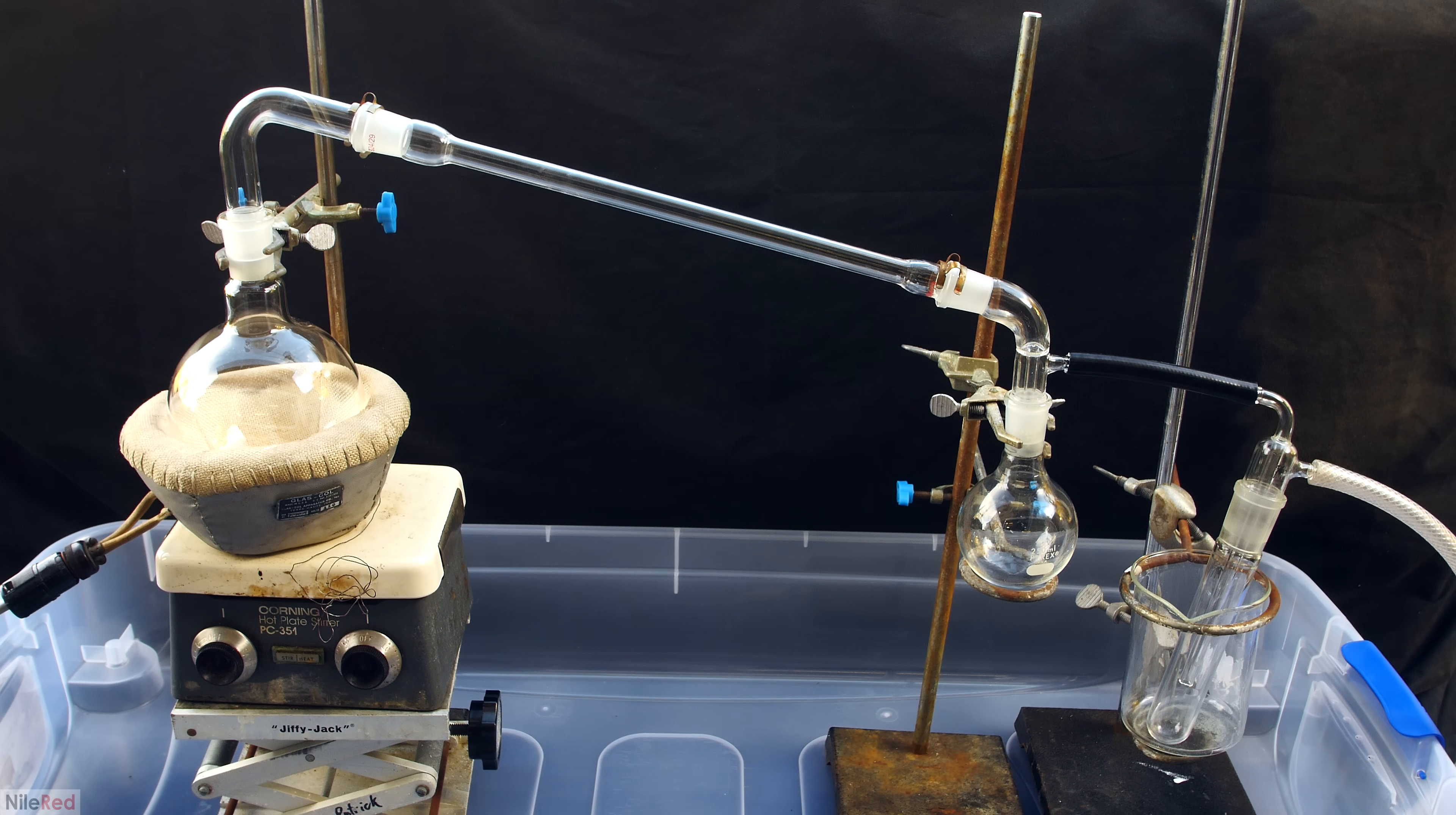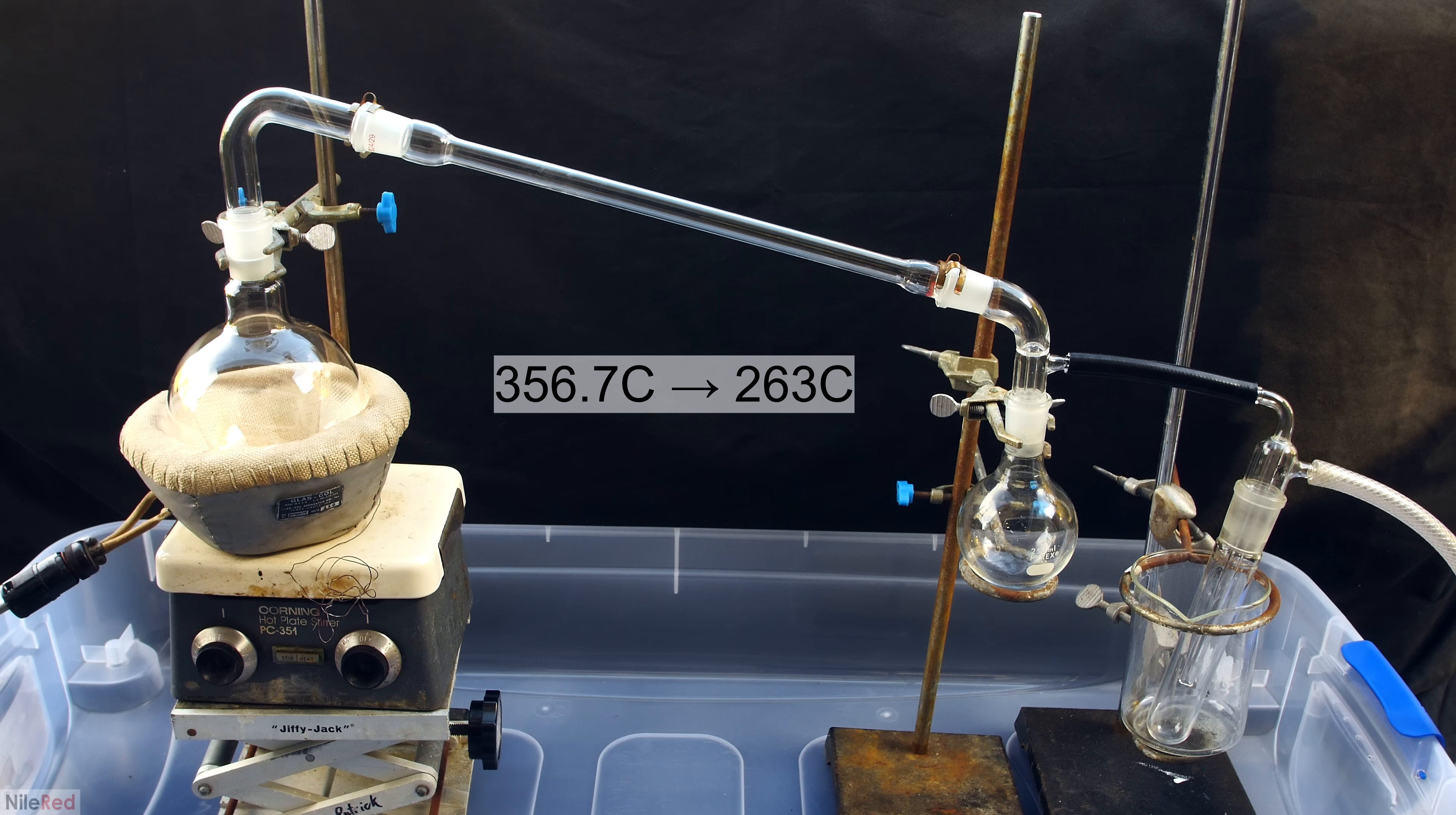Anyway, moving on, the mercury will condense in the air condenser, and be collected in the receiving flask on the right. I decided to do this distillation under vacuum, because it allows me to boil the mercury at a much lower temperature. The normal boiling point of mercury is around 360 C, and under my vacuum, I can probably get it to boil at around 260.